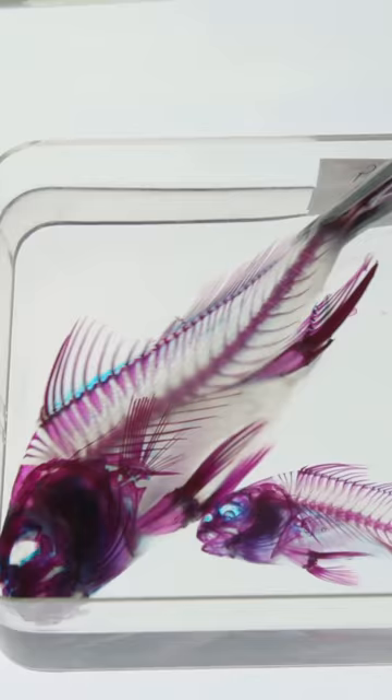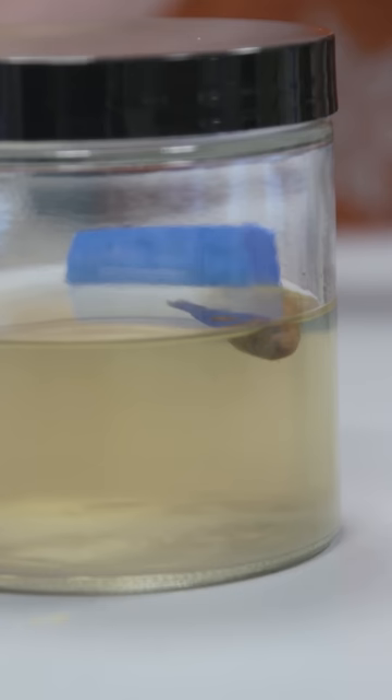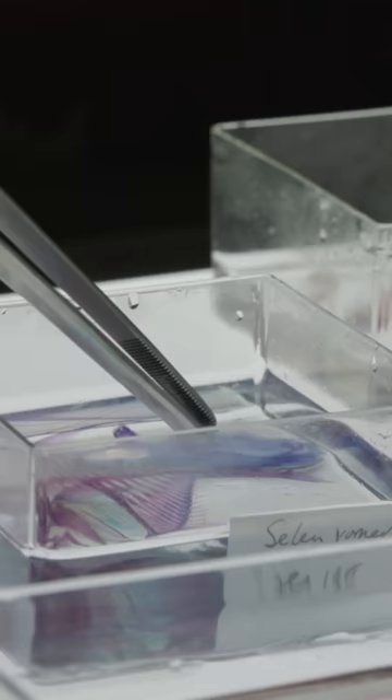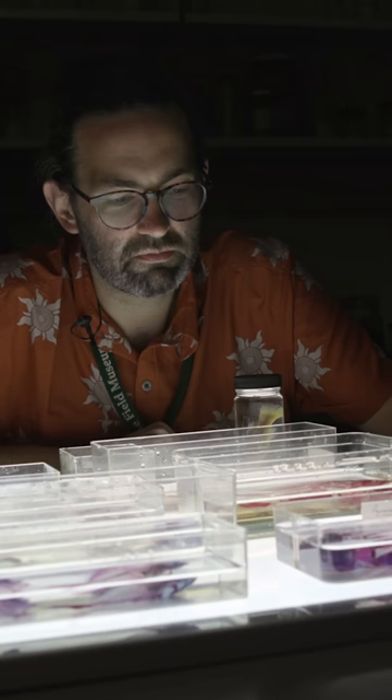Instead of isolating the skeleton, this method keeps it contained but visible inside the body. We use an enzyme called trypsin that digests proteins and breaks them down, but it leaves the collagen that holds everything together, making the fish completely see-through.